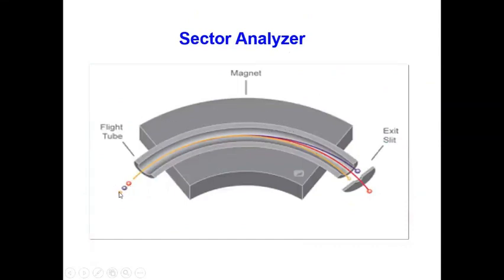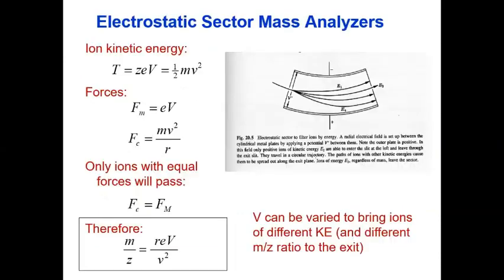When these ionized molecules from the ionization source enter the mass analyzer, only those molecules that follow the trajectory path will be detected at the detector. Other molecular ion peaks or fragment peaks are thrown out from this sector analyzer.